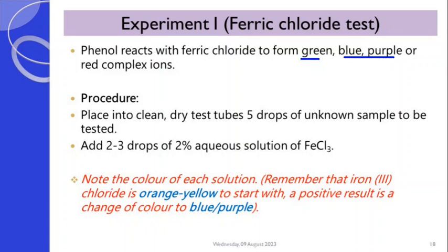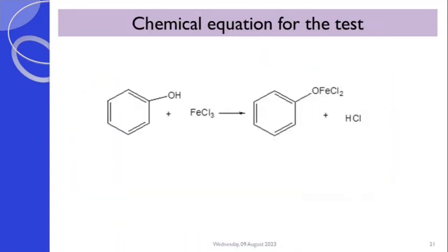What is expected to be seen? You would have your orange yellow color changing to blue or purple. This would indicate a positive color test.